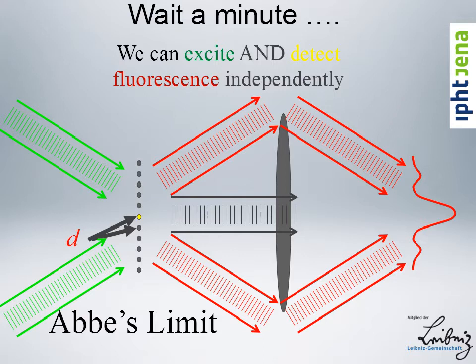This is the part of what I call linear superresolution, because the detected light in the end is just a product of illumination, local illumination, and the detection efficiency in that pixel. Nevertheless, structured illumination is all about exploiting the fact that you can structure your illumination as well as resolve features by detecting them in an imaging setup.